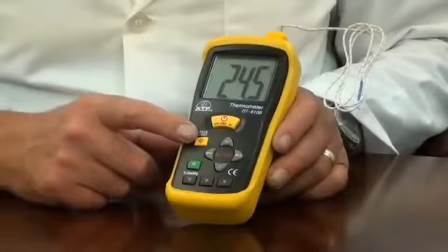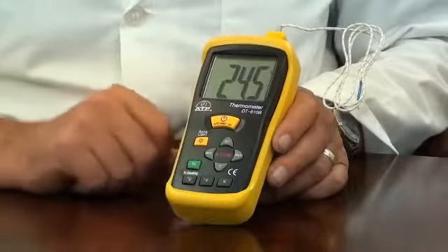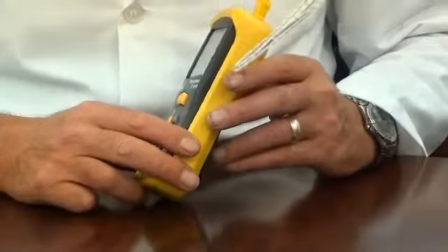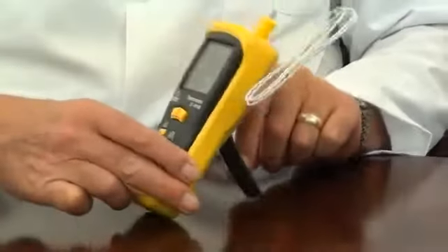The thermometer case is manufactured in an impact resistant ABS plastic and has non-slip rubber function buttons. The supplied rubber protective holster makes this thermometer ideal for working in harsh environments. It also incorporates a flip out desk stand for bench work.